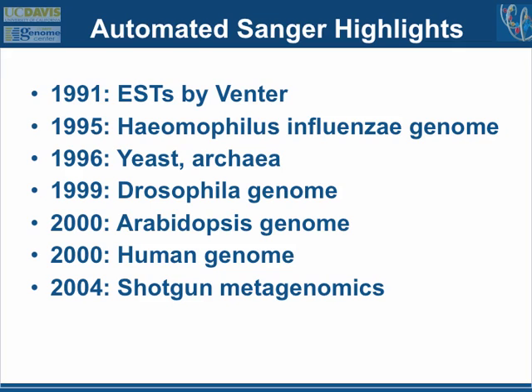So this is what I work on, where you go to a field, you collect a soil sample, you extract total DNA from that sample, and you randomly sequence that DNA from a collection of organisms. It's called metagenomics or environmental genomics. And this was, again, originally done with the shotgun sequencing with the Sanger method. So this was the way it stood until really 2004 and 2005.